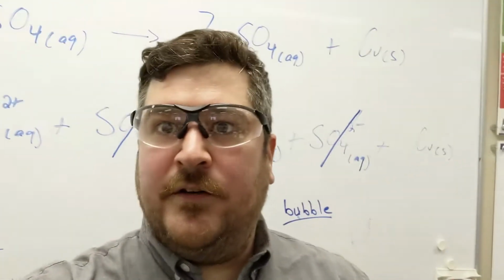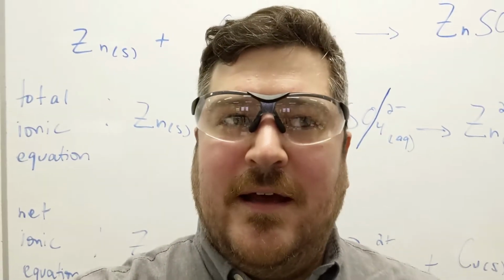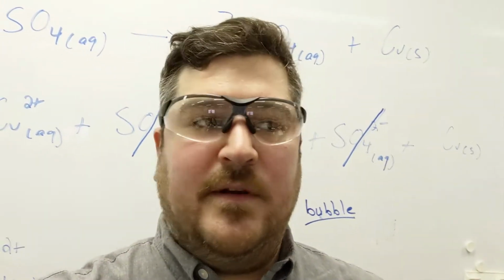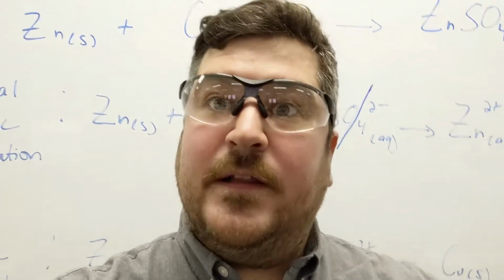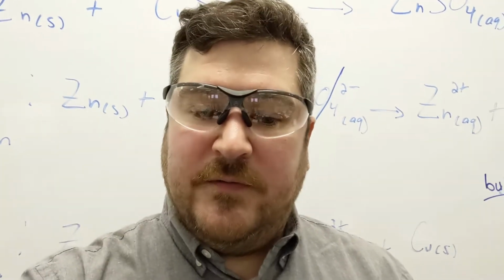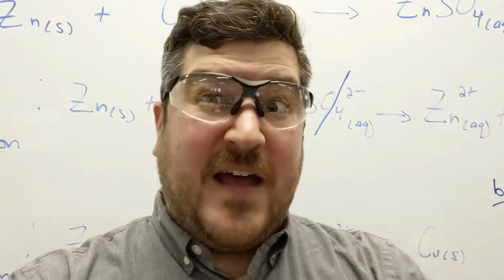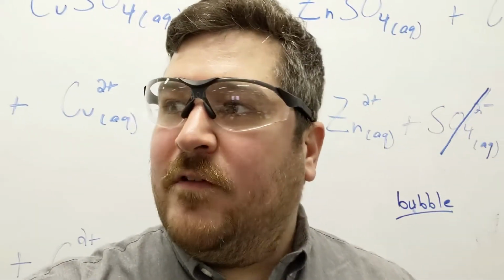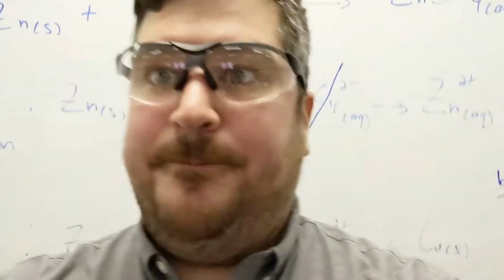In this lab, it's a little different than other labs. There's no fume hoods. There's no really crazy chemical preparations. It's more of a lot of mini experiments and demonstrations. And we're going to be looking at mixtures, specifically colloids or suspensions, which we've done in class. And then we'll look at the properties of surfactants, what a surfactant might do to some mixtures or not mixtures in this case. So I'll be right back with the chemicals. I'll run over all the chemicals and then we'll start part A.